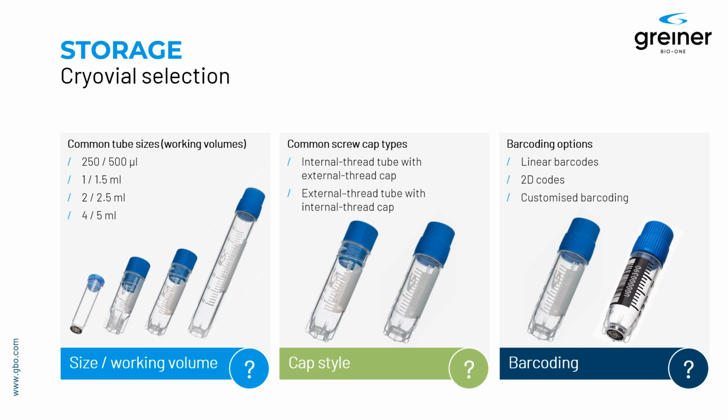In the center portion, you see an example of a 2 milliliter tube with an external thread to the right hand side and internal thread to the left. It's a bit of philosophy what to use here, and it's also a lot depending on personal preferences. However, today we see a trend towards the internally threaded tubes when the intention is to maybe use automation and go for more automated processes, because here the internal thread of the tube, the external thread on the screw cap have proven to add process stability and automation compatibility.